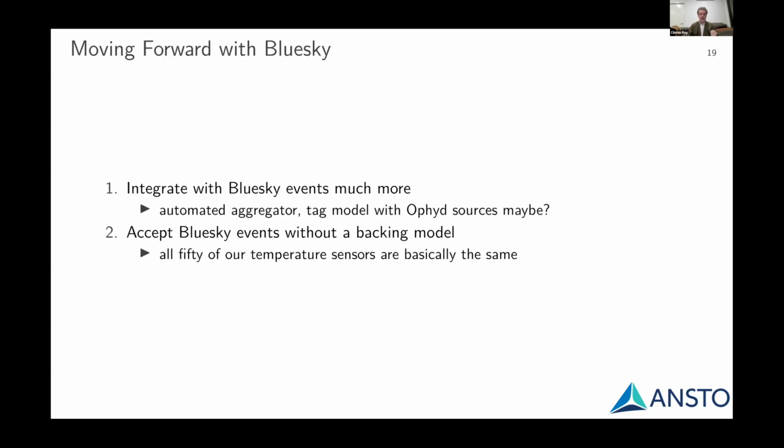So I see the HDF5 file as a really powerful format to describe everything that happens to a user through their experimental run.